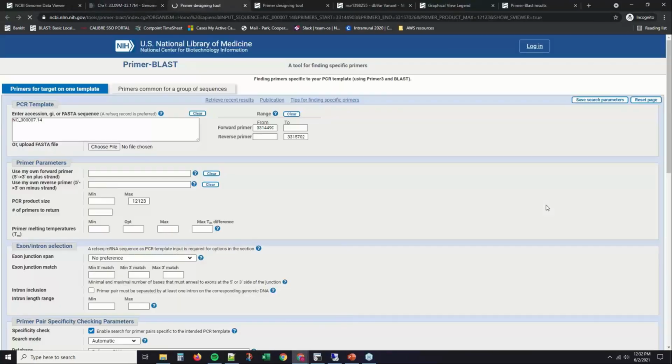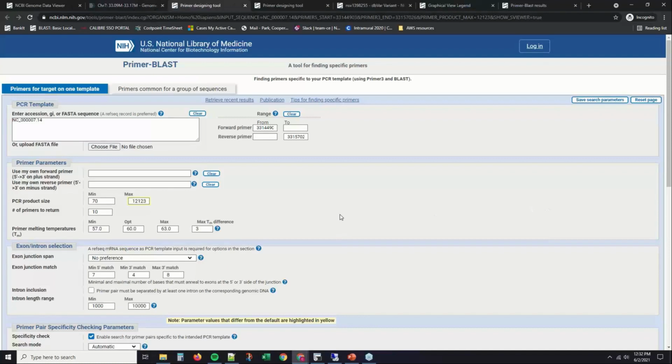If you want to, you can specify in the forward and reverse boxes exactly where you want the primers to bind. Yeah, because that's a reasonable thing to do. So you could perhaps get some primers that would span that entire region. It might be pretty big, though. I'm not sure how large it is. It's pretty big, but that's a way where you can set the primers to bind where you want them to go. Oh, great! That's good to know.